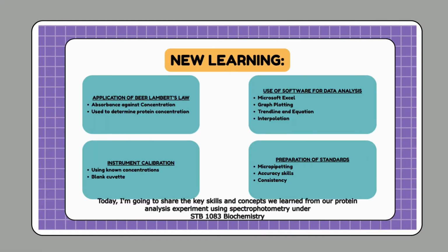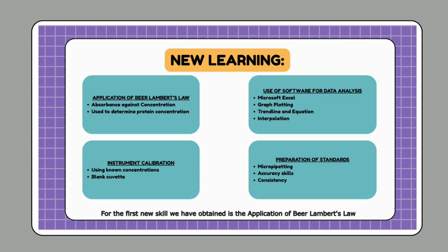Hello everyone. Today I'm going to share the key skills and concepts we learned from our protein analysis experiment using spectrophotometry under STB 1083 Biochemistry. So the first new skill that we've obtained is the application of Beer-Lambert's law.